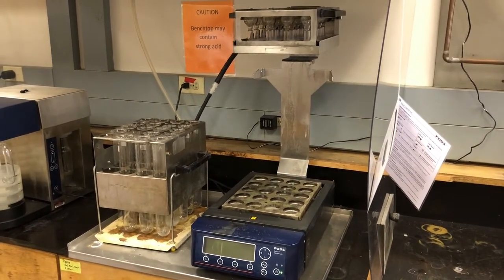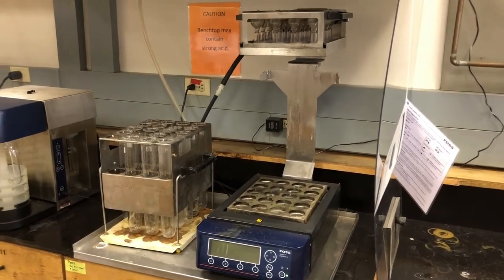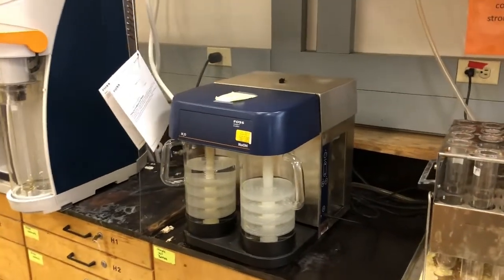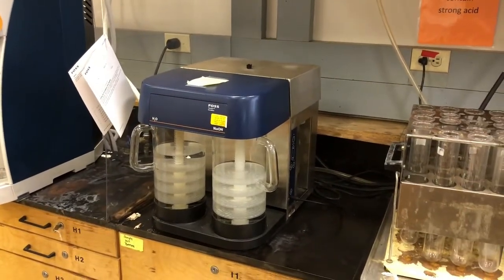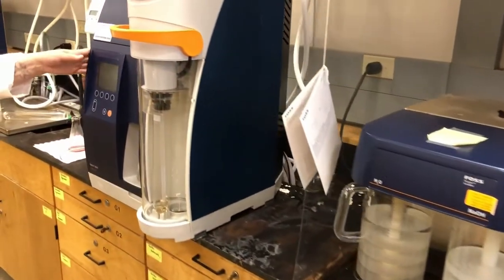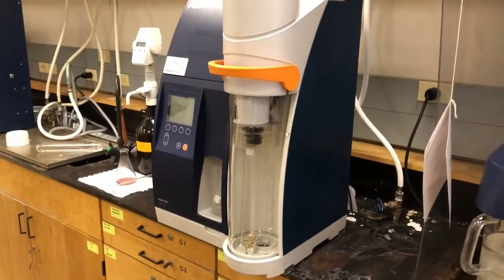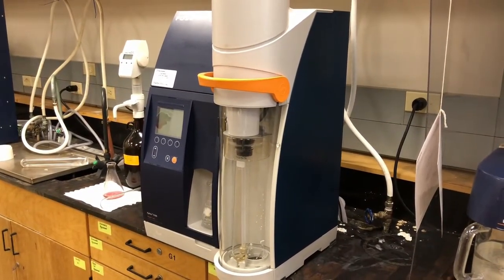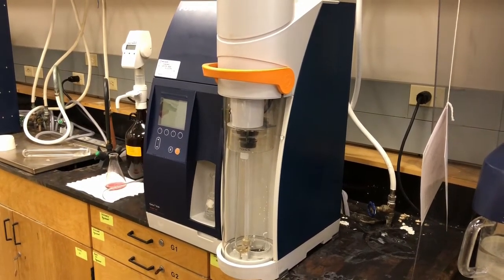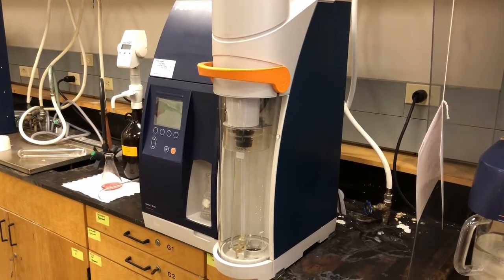So once that's done, that runs for about half an hour or so, then we let the tubes cool down. This is a scrubber which cleans up any of the harmful vapors that are given off. I'll explain that in more detail later. So once the digestion is done, then we move over and we do a distillation. So we have another piece of equipment for that. So in the distillation, we add a strong base to it, so sodium hydroxide in this case, and it is a steam distillation that distills the ammonia from the sample into boric acid.